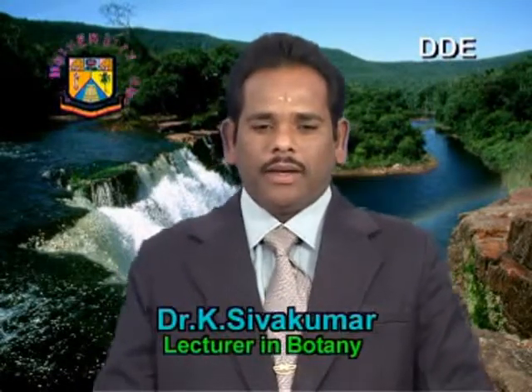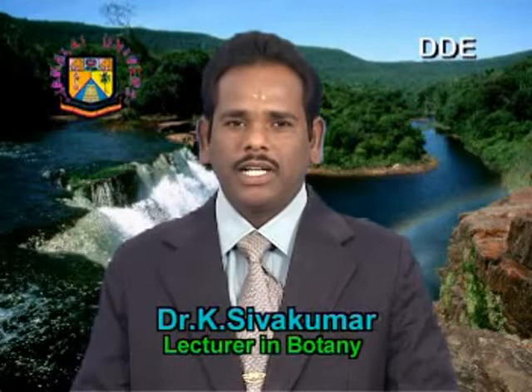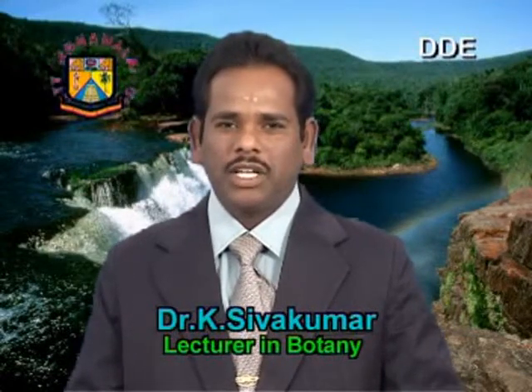Dear students, today I am going to explain to you material preparation for transmission electron microscopic studies. Regarding material preparation for transmission electron microscope studies, I want to tell you some more background information about how to prepare the specimen for the block.